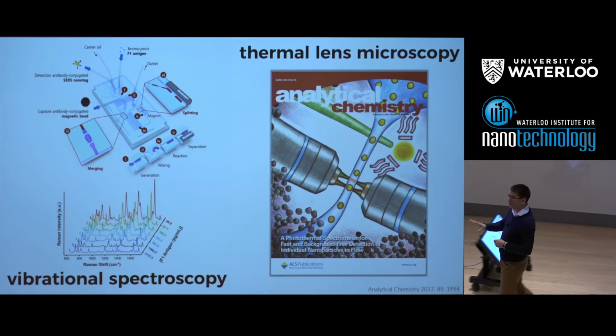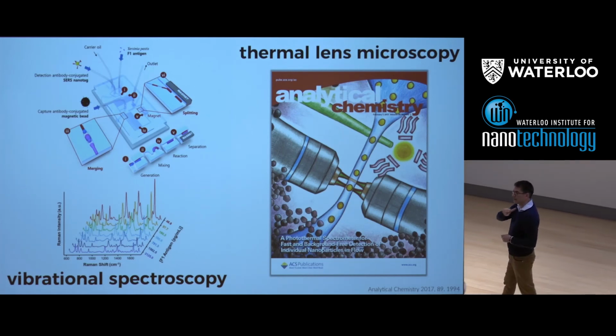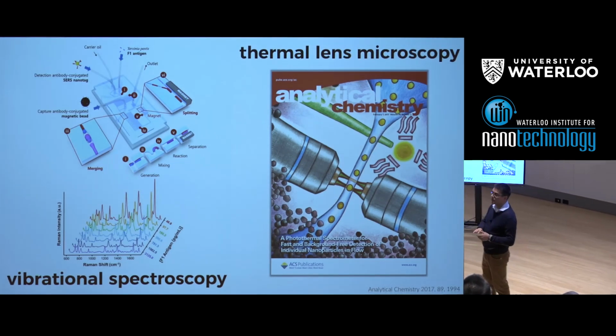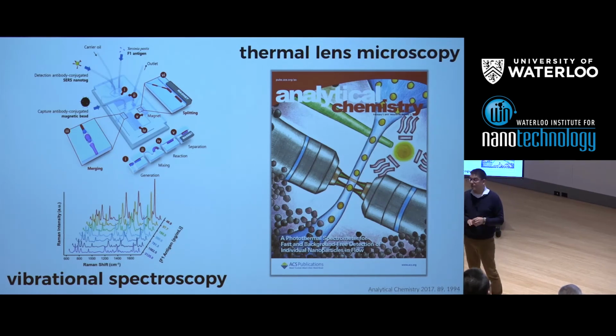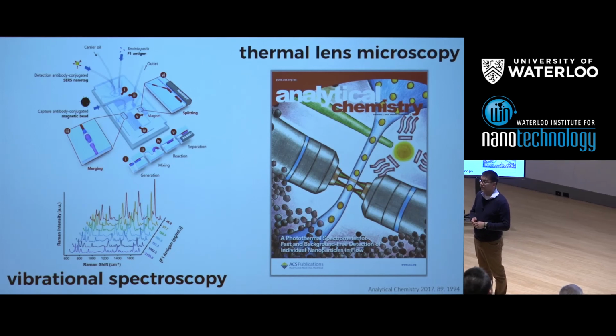What's very nice about this is we can again look at non-fluorescent systems and effectively get a proxy for the absorption measurement, but at very, very low limits of detection. So I think this technique, in tandem with vibrational measurements, would be very useful for both small molecule and nanomaterial chemistries. So the bottom line is that you need lots of different detectors.